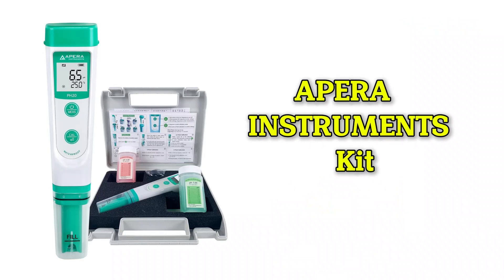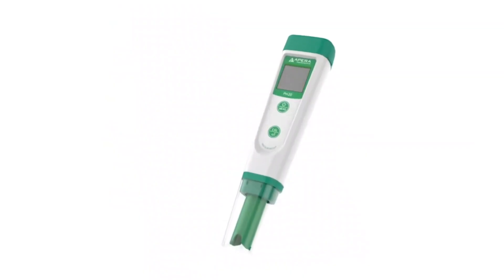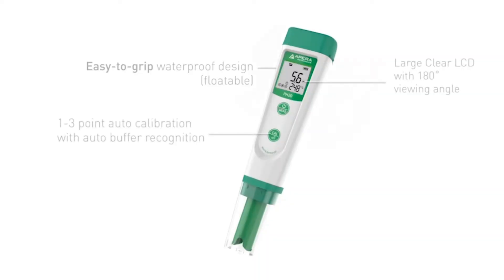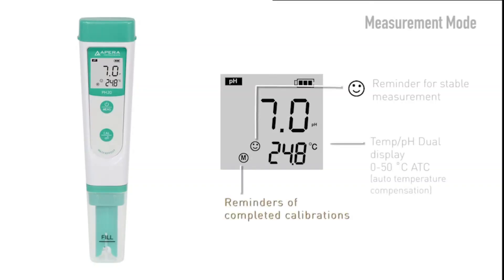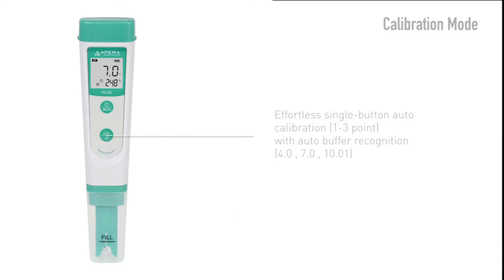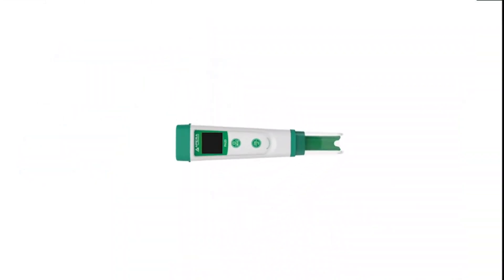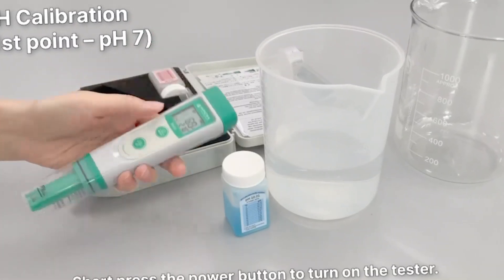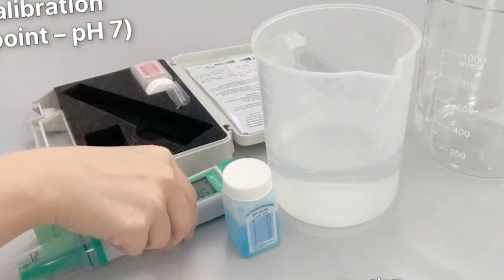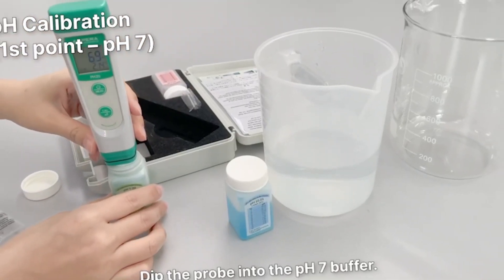Number two: APRA Instruments kit. If you are looking for a reliable waterproof pH meter with professional accuracy, this APRA model will surprise you with its quality. The APRA Instruments pH 20 is designed to provide fast and accurate results across a wide range of applications. One of its most impressive features is its replaceable electrode — if over time the electrode wears out or is damaged, you do not need to buy an entirely new meter. You simply replace the electrode and your meter will be like new, saving you money in the long run. Additionally, it has automatic temperature compensation, so whether you are measuring a cold or warm sample, the meter will automatically adjust the reading to give you a precise result.